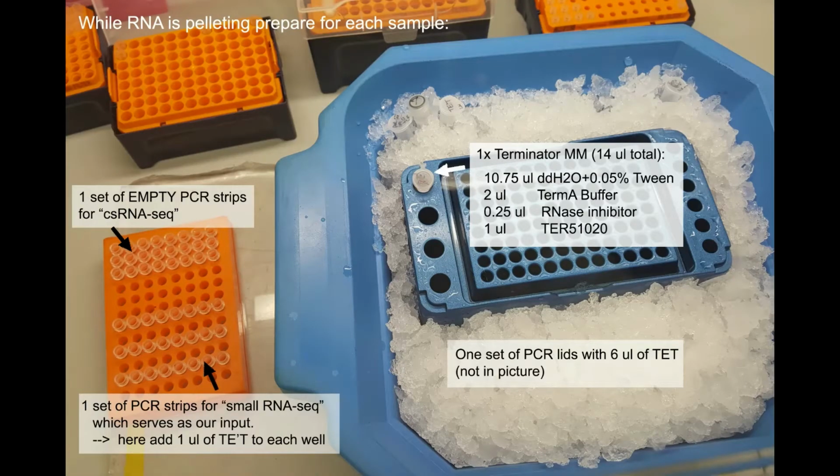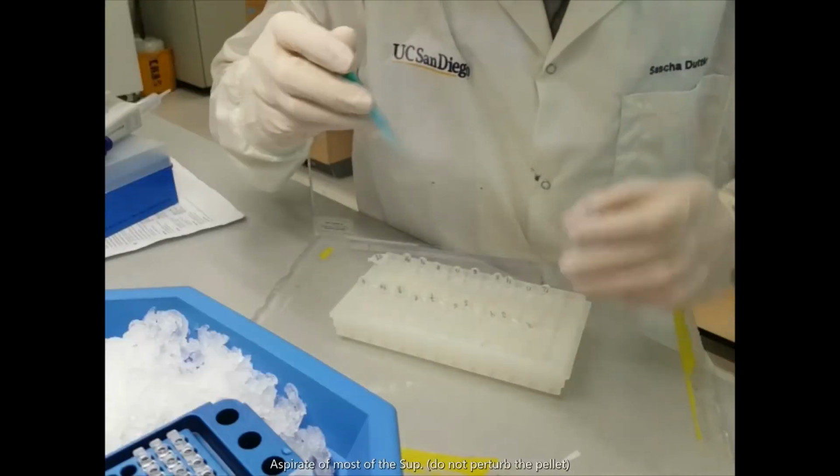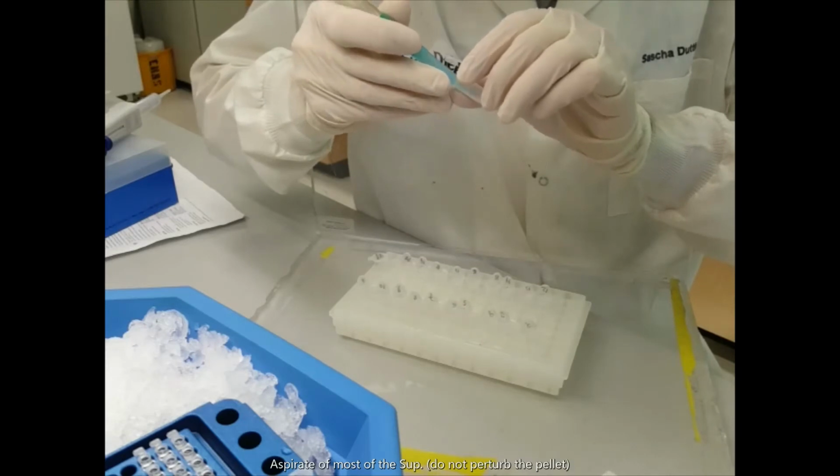Meanwhile, while the RNA is spinning, you can prepare four things. First, one set of empty PCR strips that are just labeled. These will contain your csRNA-seq samples. One set of small RNA-seq sample strips, for each of which you add 1 microliter of TET. You may also prepare one set of PCR lids that contain 6 microliters of TET and a terminator master mix.